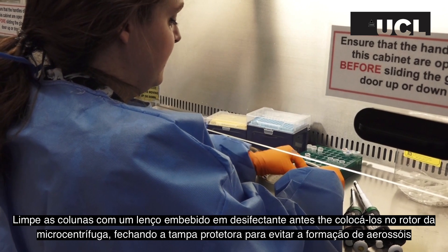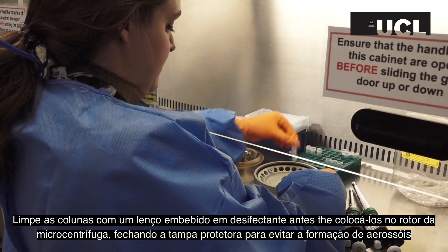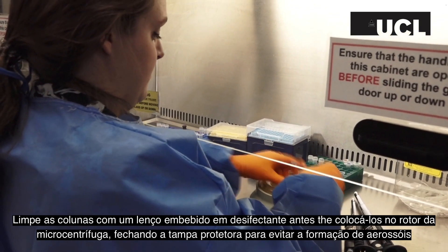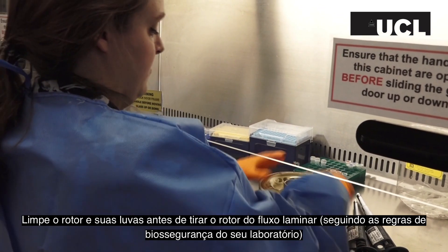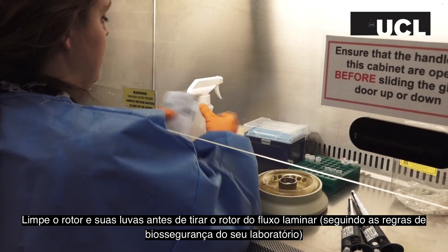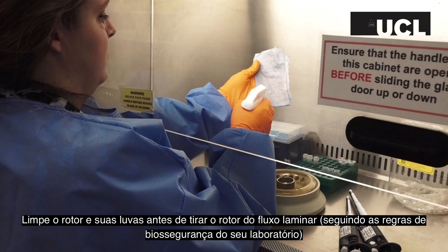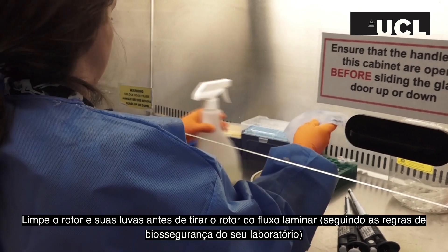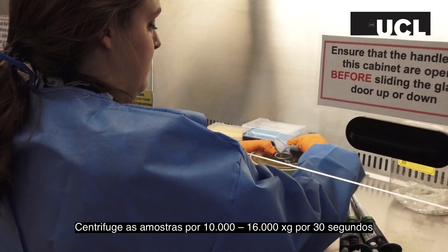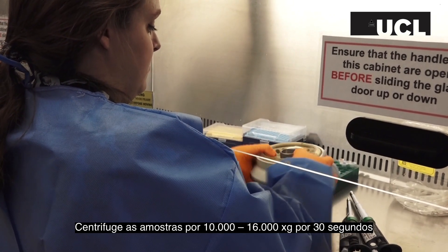Carefully wipe down the spin columns and collection tubes with disinfectant before placing them into an enclosed microcentrifuge bucket to contain any aerosols produced. Wipe down the outside of the bucket and your gloves with disinfectant following your local safety rules. Remove it from the biological safety cabinet and place into a microcentrifuge and spin at 10 to 16,000 g for 30 seconds.